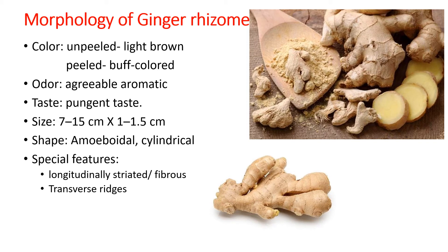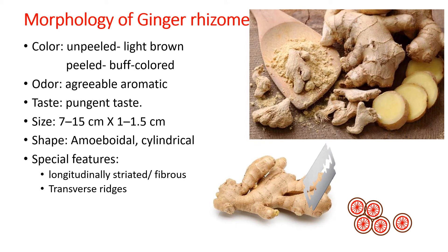To take a transverse section, hold the ginger and cut fresh ginger in a perpendicular manner to get circular tiers. There is no need for a complete circular tier; even a single wedge-shaped portion will do, provided it has cell layers ranging from the cork towards the center.